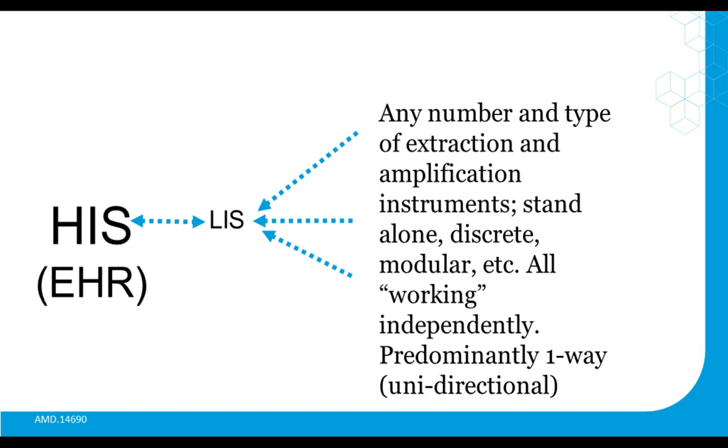So what has advanced at the hospital level is a proliferation of specialized systems to make sense of and categorize digital images and other discrete pieces of information that HIS can't sort out or isn't capable of rendering into useful information. Now, likewise, you have the LIS in the same situation, the lab information system.